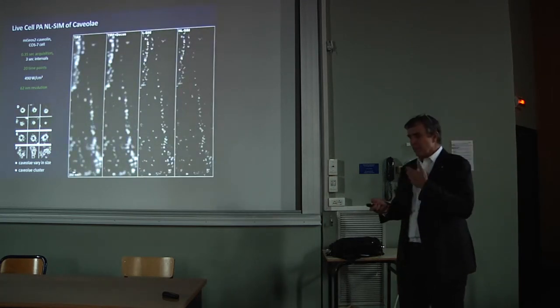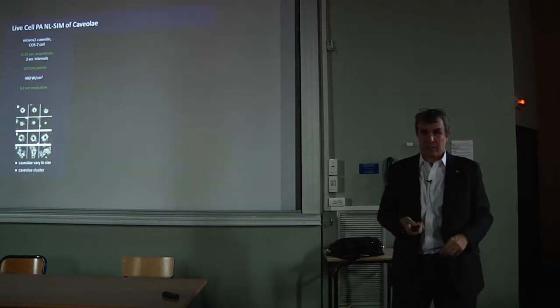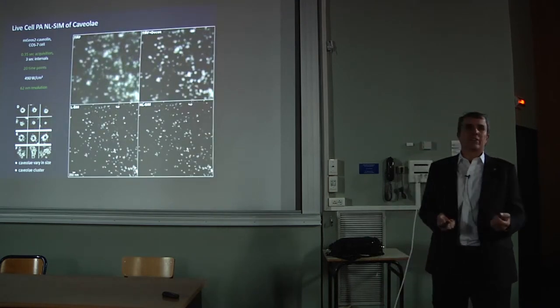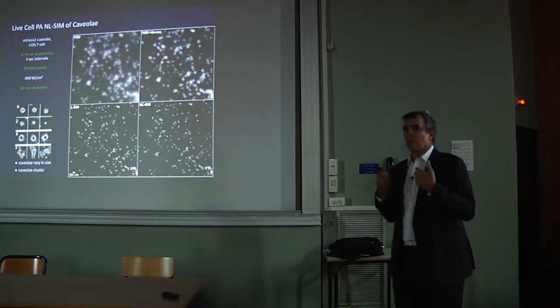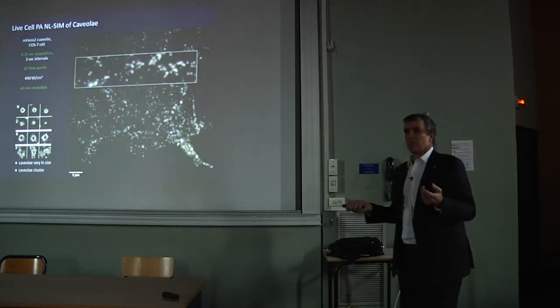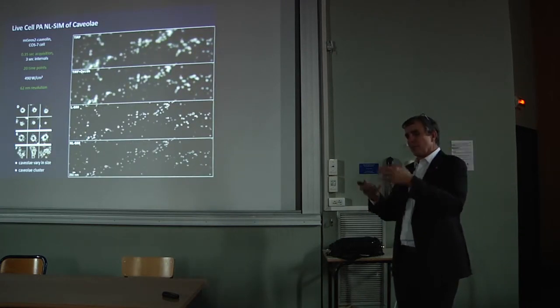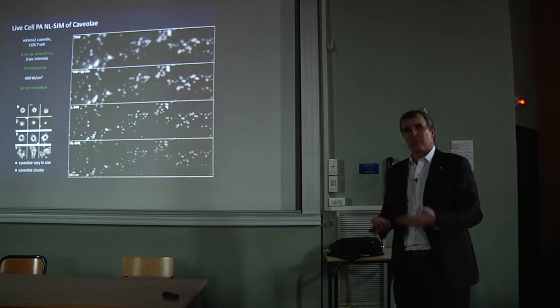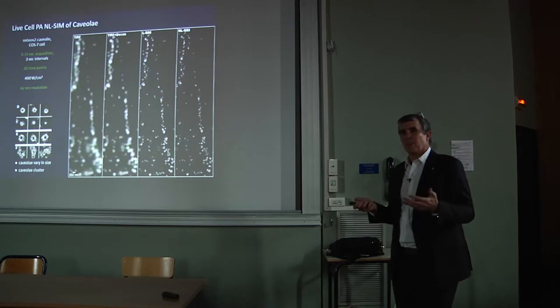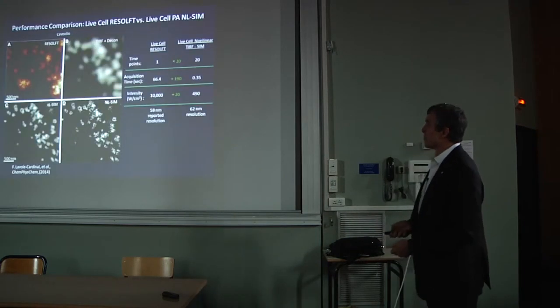And what we find is in the EM literature, there's a very stereotypical size. 70 nanometers is the size of a caveolae pit. What we find is that there's a great variety of sizes, and we don't know the reason for that discrepancy. Some of this could be that we're looking at multiple pits stacked together, but the other possibility is that when you look at an EM image, it's just black and white. You don't know what protein is where. The advantage of fluorescence is you have that protein-specific contrast, and we know where all the caveolin is.